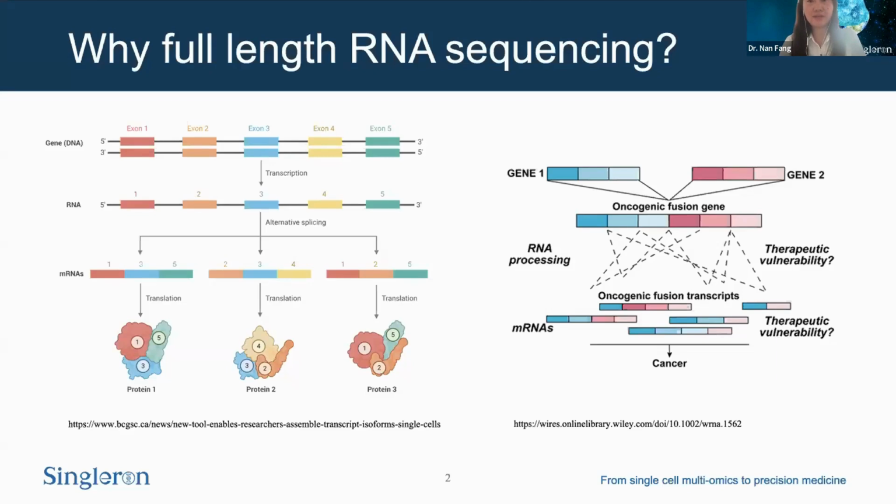Besides splicing isoforms, there is another phenomenon in the cells, especially in cancer cells, that's called fusion. This happens when the chromosomes of a cell become unstable, and pieces from different genes, which shouldn't be together to start with, now join each other and form a totally new RNA that doesn't really exist in nature or in a normal cell.